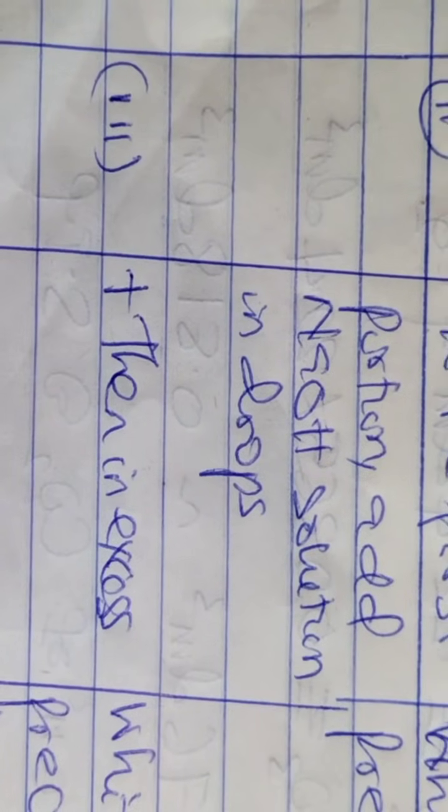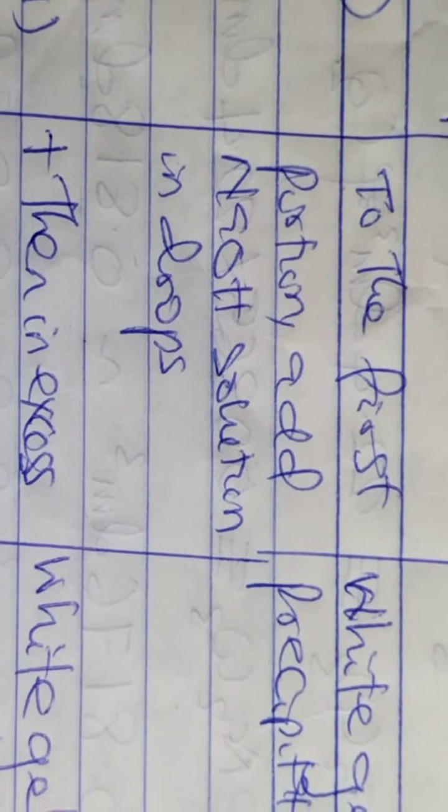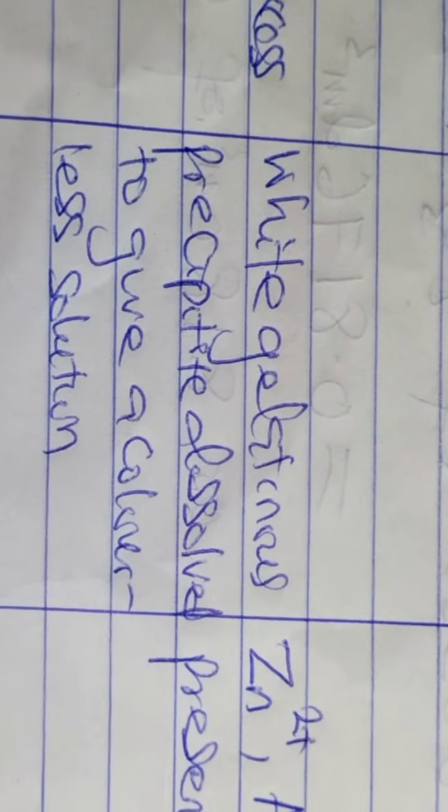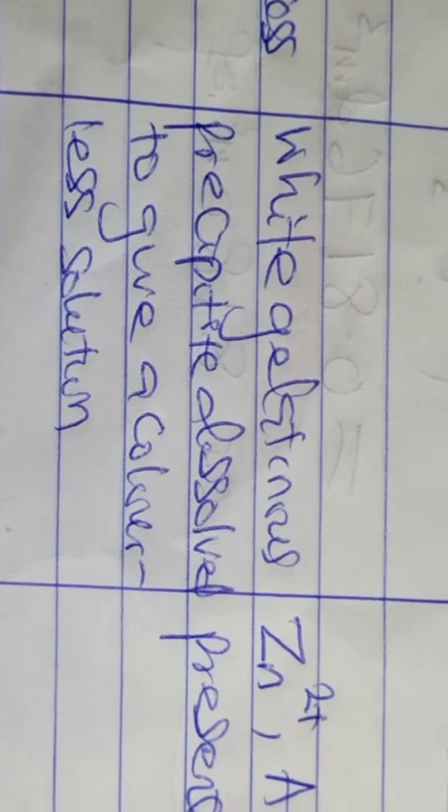Okay. Then III says plus then in excess. There is something added in excess now. We're going to observe white gelatinous precipitate dissolved to give a colorless solution. Then also the same inference, zinc 2 ion, aluminum 3 ion present. The same comma, never you use and.